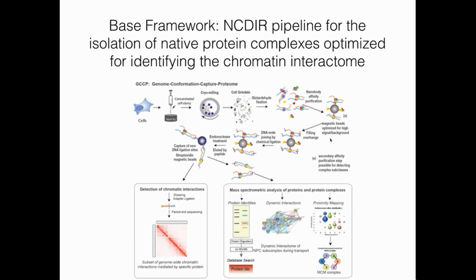Yeah. So in that particular picture, we don't have the scale bar in there, but we've done other cryo grindings, and the pieces are sub-micron in size. To address the other question, when we add the grindate to lysis buffer, we do a mild sonication to break apart all those particulates. And then we do centrifugation to clarify all that.